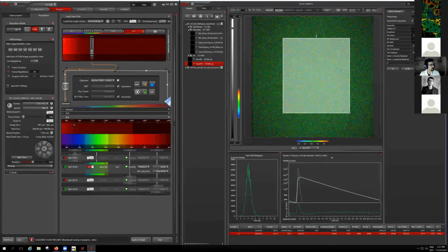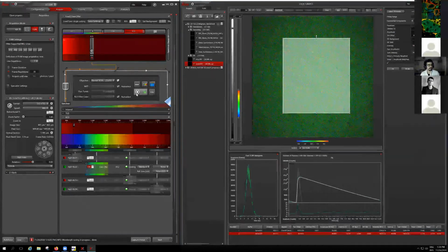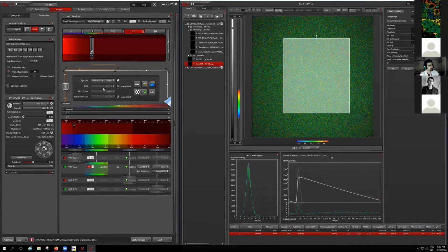In our system we use the auto select option for the different components that can be on the optical path. Everything is automatically selected. Usually what I do is check that this component is a short pass filter, and also the filter cubes in the revolver in the microscope body, and the fluorescence turret, to make sure they are correct.